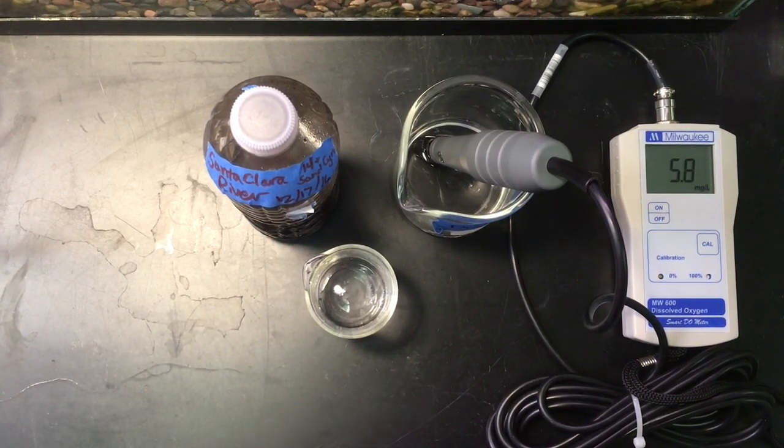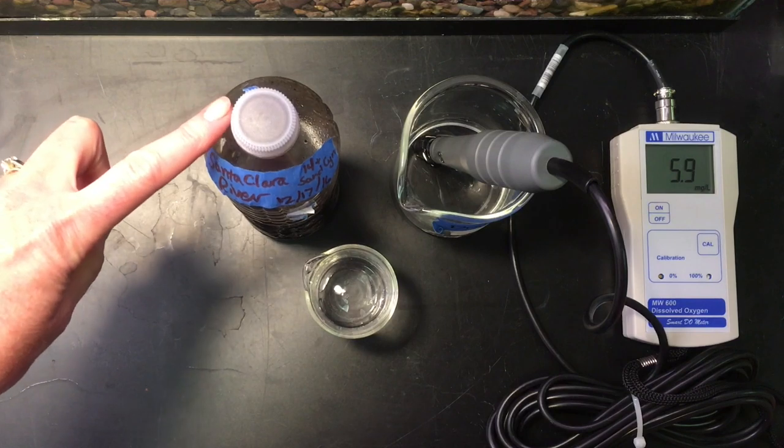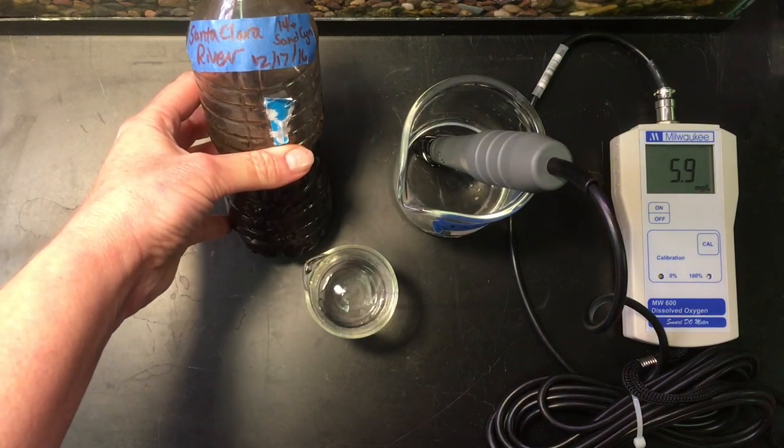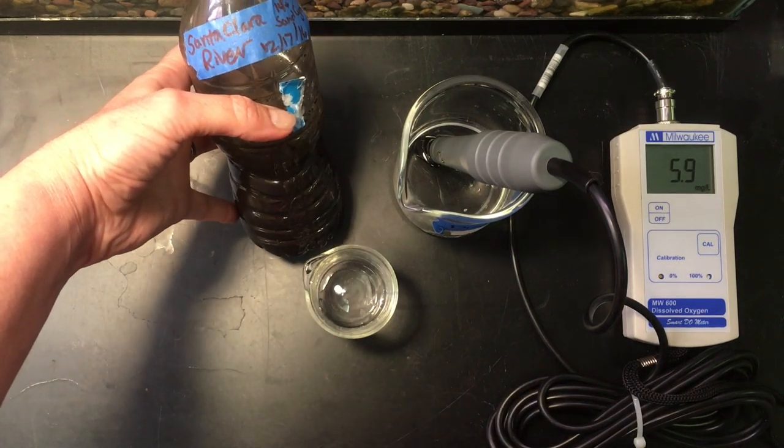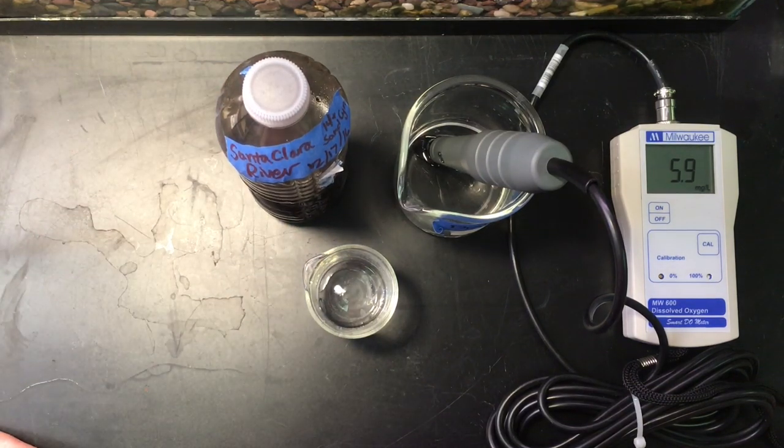I'm going to show an example of a sample of water that has extremely low dissolved oxygen. So this was taken from the Santa Clara River in December of 2016 and it's full of debris. And so this sample actually came from river water that had run through a watershed that had burned the previous summer.